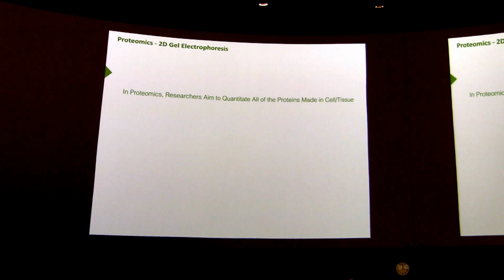Now you might say, well, SDS-PAGE did that. And what you'll see is that what I'm getting ready to show you is a much more powerful method than SDS-PAGE, because SDS-PAGE squeezes everything into one lane, and while we see a whole bunch of bands in there, we don't get very good quantitative information about each protein. The method I'm getting ready to show you gives us very quantitative and reproducible information about every protein that's found in a tissue, for example, or a cell.